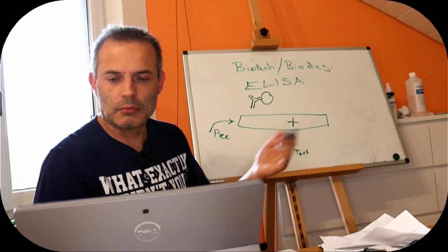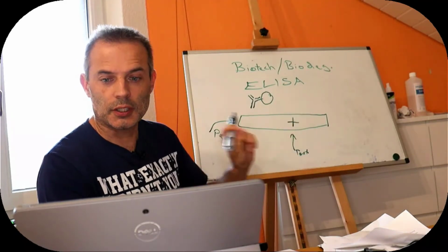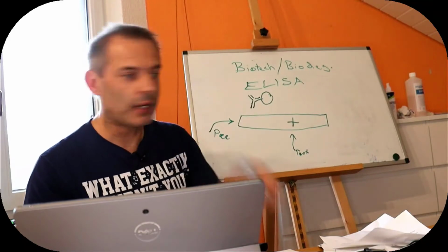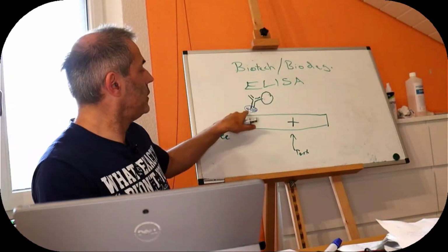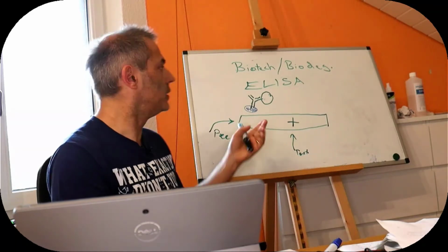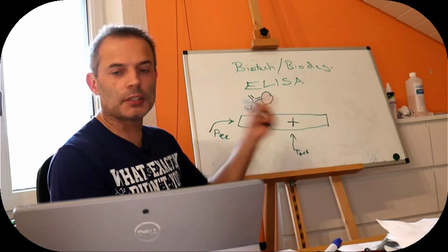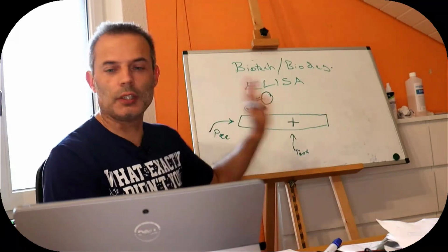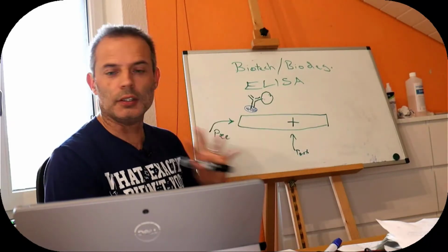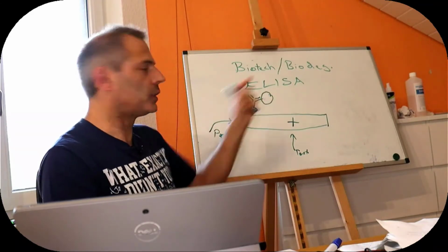That doesn't help us very much at the moment because we haven't made it coloured, so we can't see it, and we haven't... let me stop so I can get another pen. So here I am with my other pen. This is a dye molecule, so it's blue. I've just drawn it like that because it's going to go along with the wee, and we need to have it stick on to this position in two ways so that we can make the two symbols that we want to determine whether it's worked and whether we have the molecule in the wee.